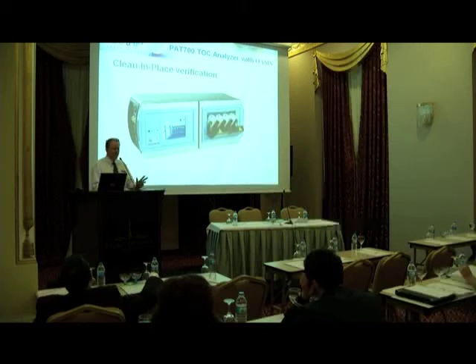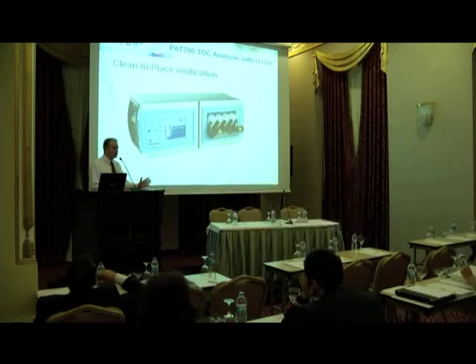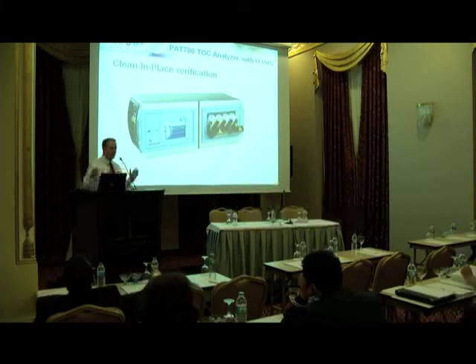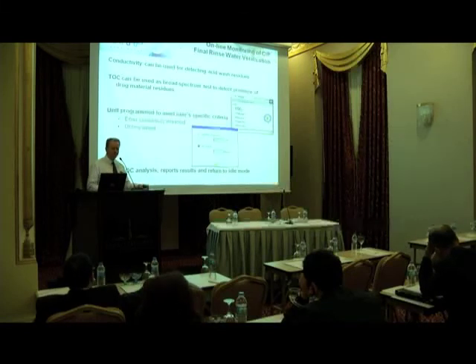One of the applications that I've seen growing over the last few years is the use of TOC, not just for water quality online, but also for clean in place. So if you're cleaning your vessels down prior to reusing them, then TOC is quite a nice catch-all. It's a nice parameter which will catch a broad range of contaminants. So you can use it for your final verification that the cleaning of the vessel has been carried out correctly.